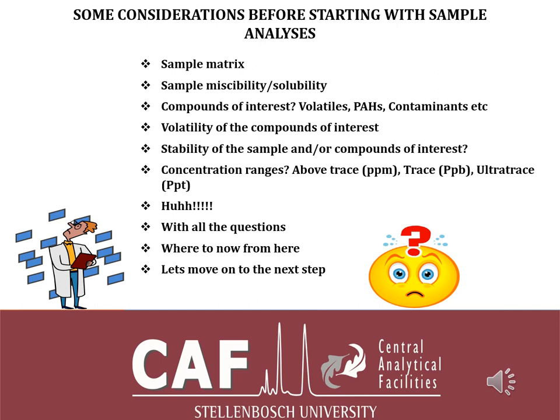Why is that important? It is important because some of us are working with ppm, and maybe from 1 ppm to 100 ppm, you might have to dilute your sample instead of working at those higher ranges, because most of the instruments are very sensitive at above trace and in ppm. So you might even have to reduce the concentration level of the standard, because for some instruments, depending on the compound, you might lose linearity when you work at higher concentrations.